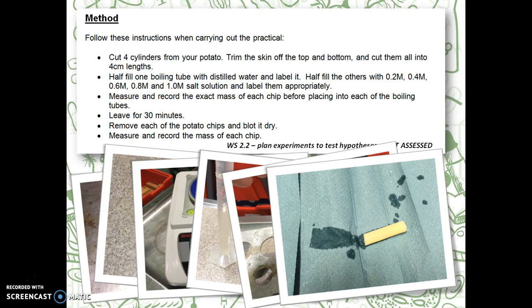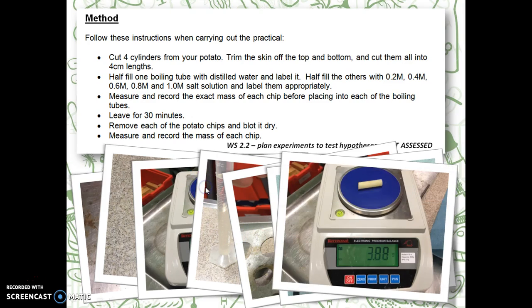Another thing about making it a fair test: once you've taken the potato out of the solution after 30 minutes, we're blotting it dry, putting it on paper towels, because the water on the outside of it weighs something. So even if you just dipped it in for 5 seconds and picked it out again, it's going to weigh more unless you dry that water off the outside. And again, that could be another cause for an anomalous result. And then weigh it again. In this case here, I only just dipped it in and took it out, so obviously it's not changed, but that might happen for something on your investigation.